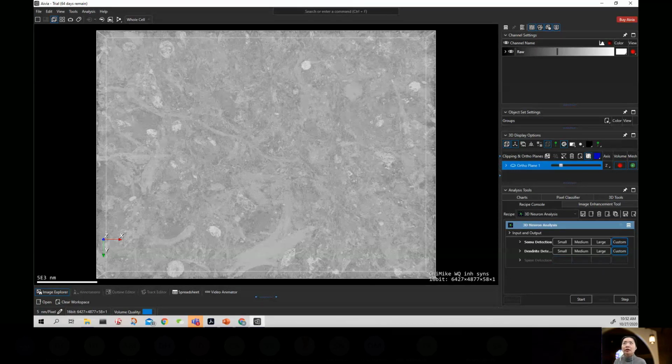Right now we are using just one data set that we acquired for the project to train the UNet deep learning model. As I mentioned, we are definitely trying to apply this trained model to other data sets we already have, not only for the mouse retina.